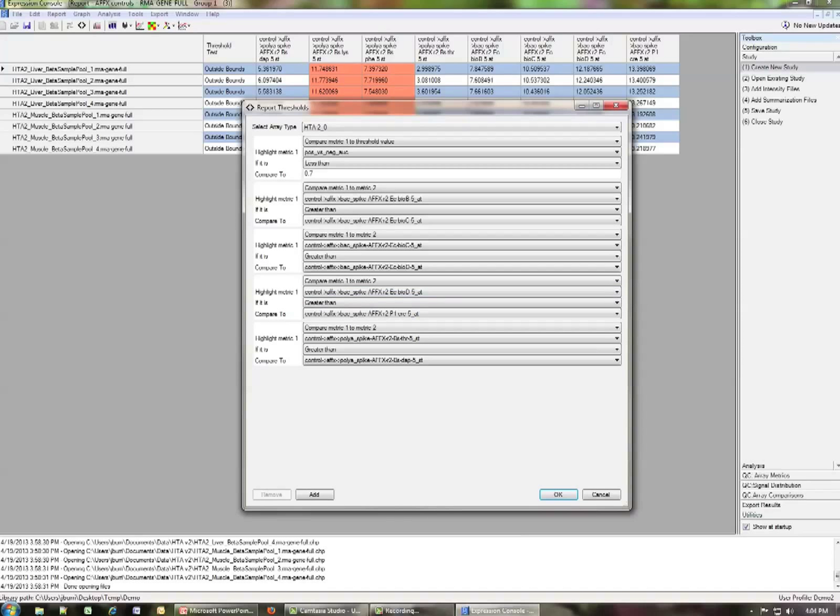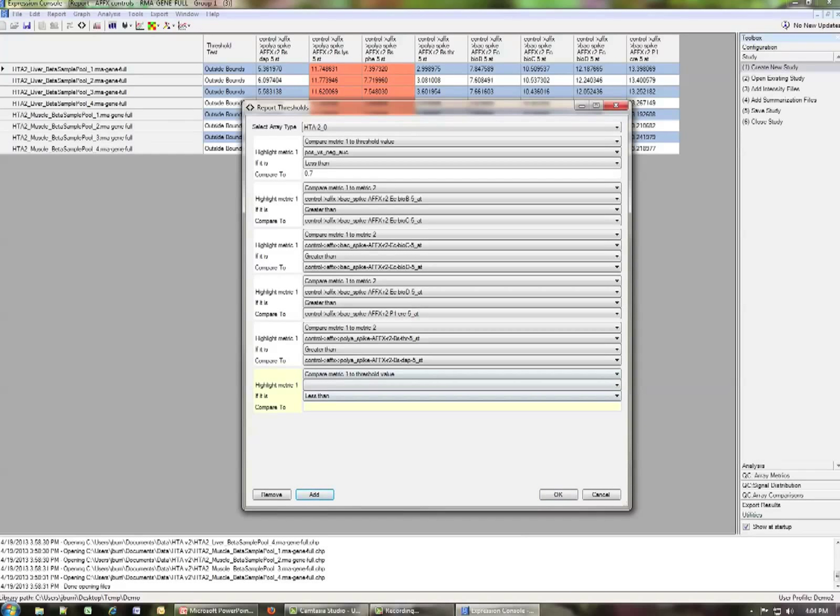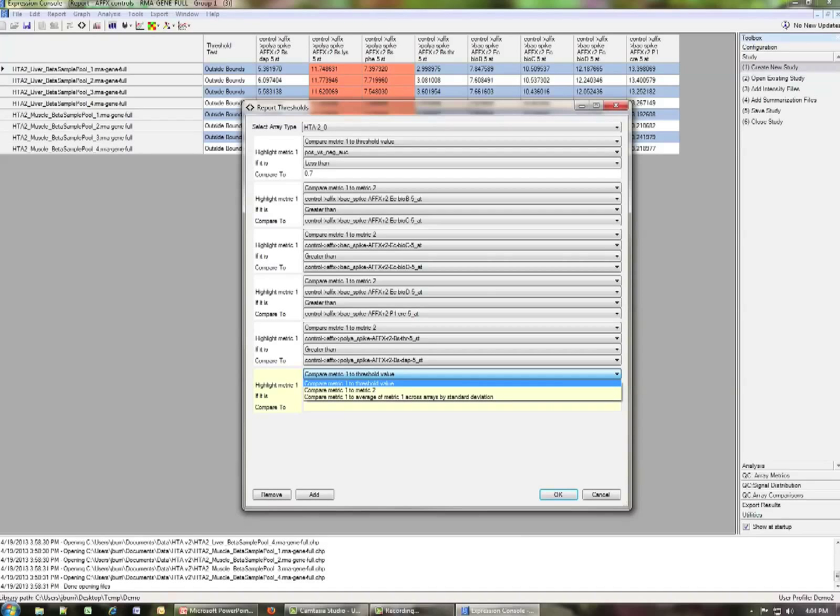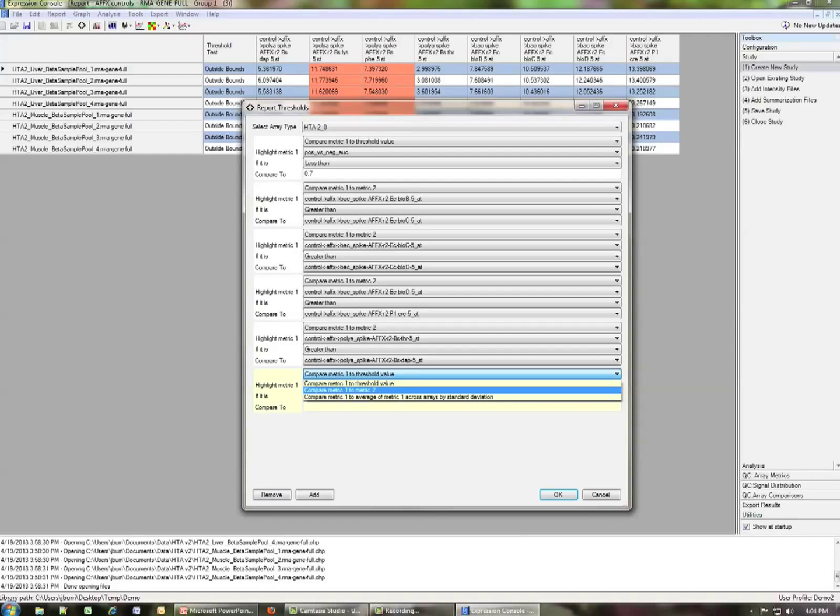If you want, you can add your own thresholds on any of the existing metrics in the array. In order to do that, you click add. So when you choose to do the comparison, you have three ways to set thresholds for the metrics. The first is you can compare a metric to an individual threshold value, as was done for the positive versus negative AUC. Second, you can choose to compare two metrics to each other and say that you'll highlight one if it's not greater than, less than, another one.